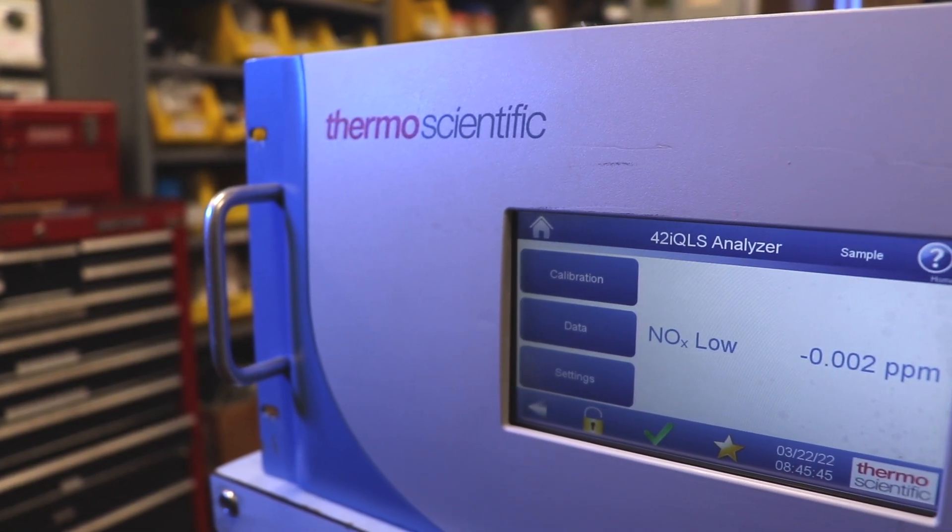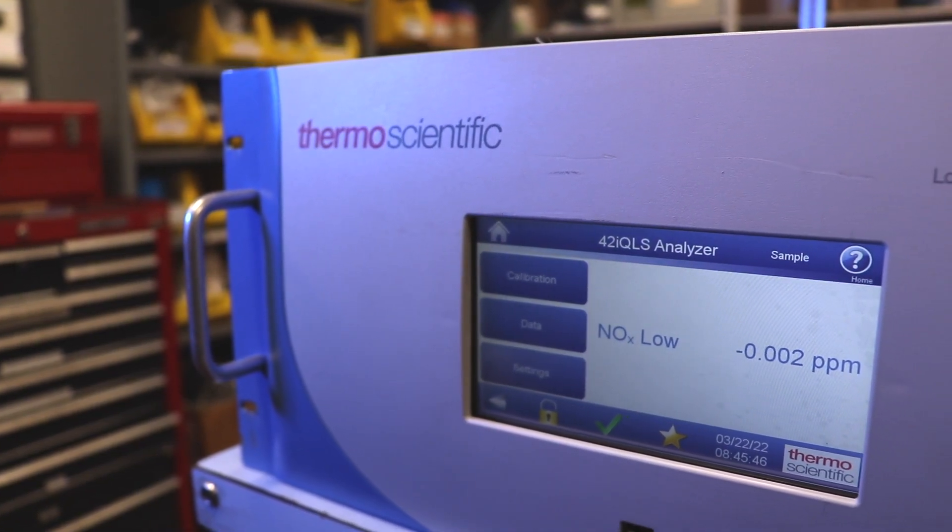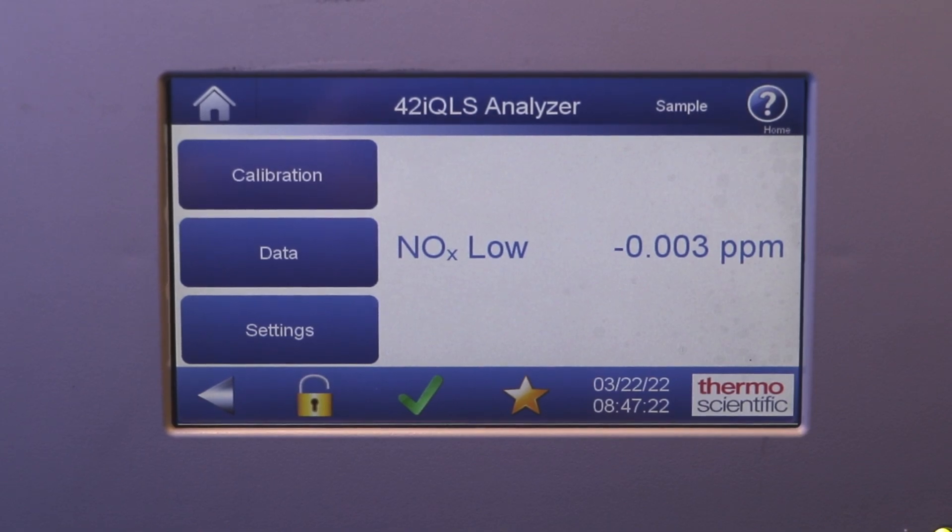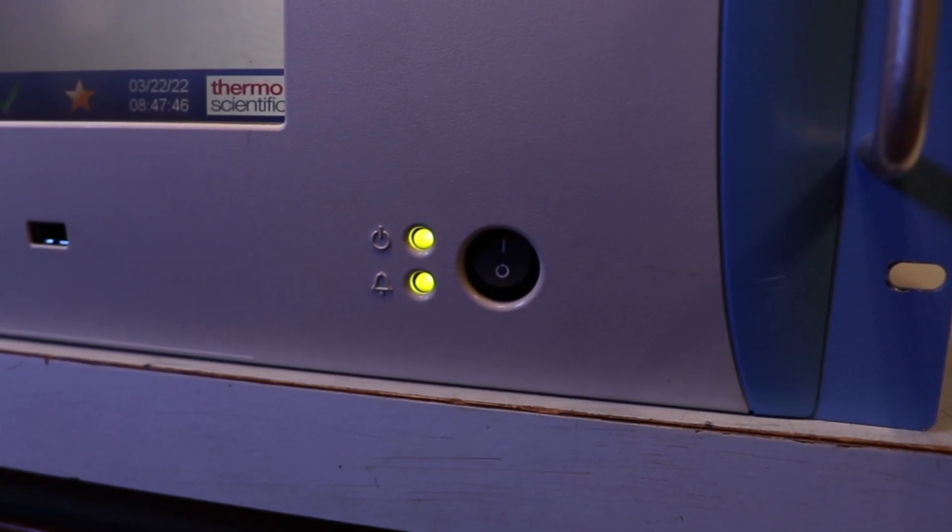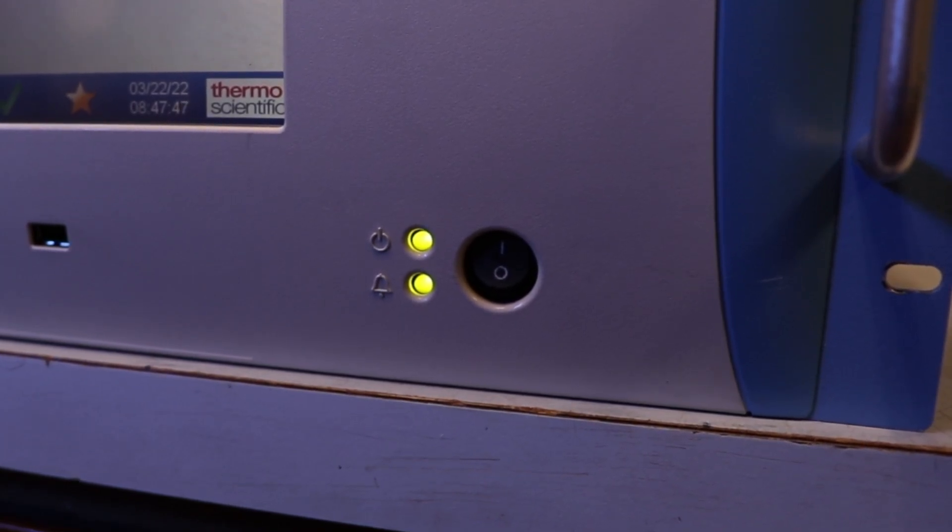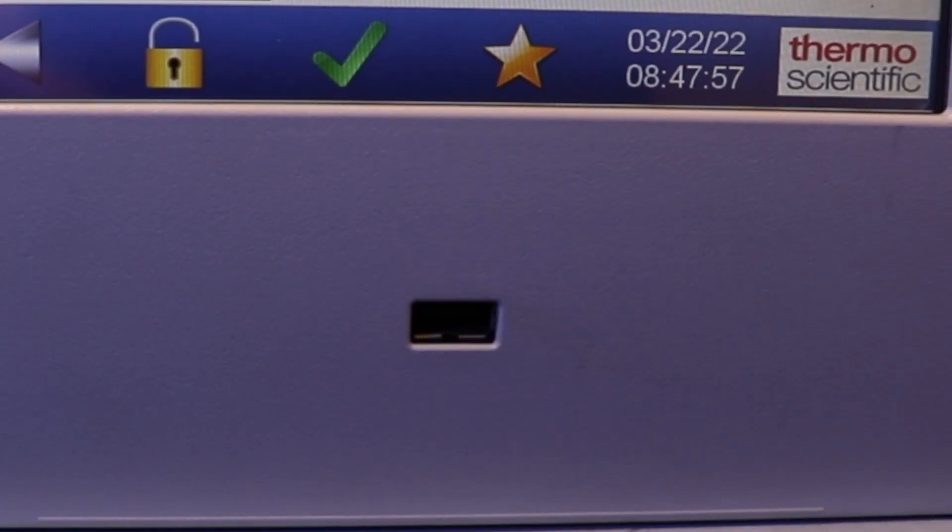Let's review the basic layout of the analyzer. We can begin with the external components. On the front panel, we have the LCD touchscreen, power switch with LED, alarm LED, and a USB port.